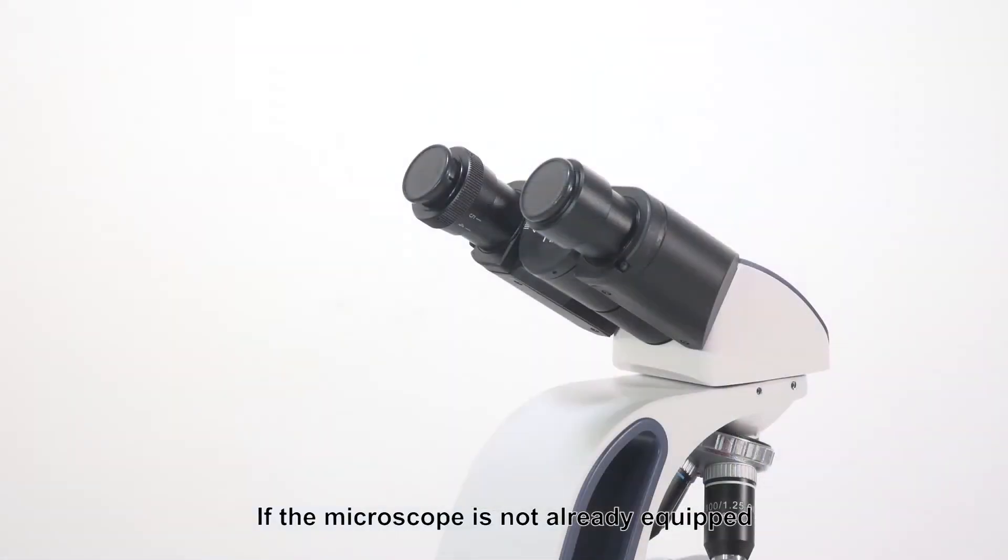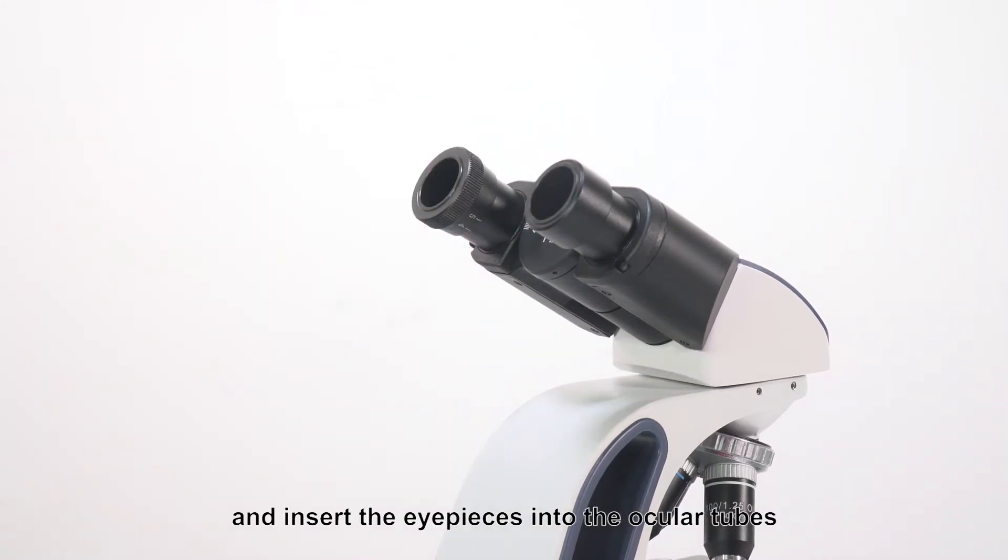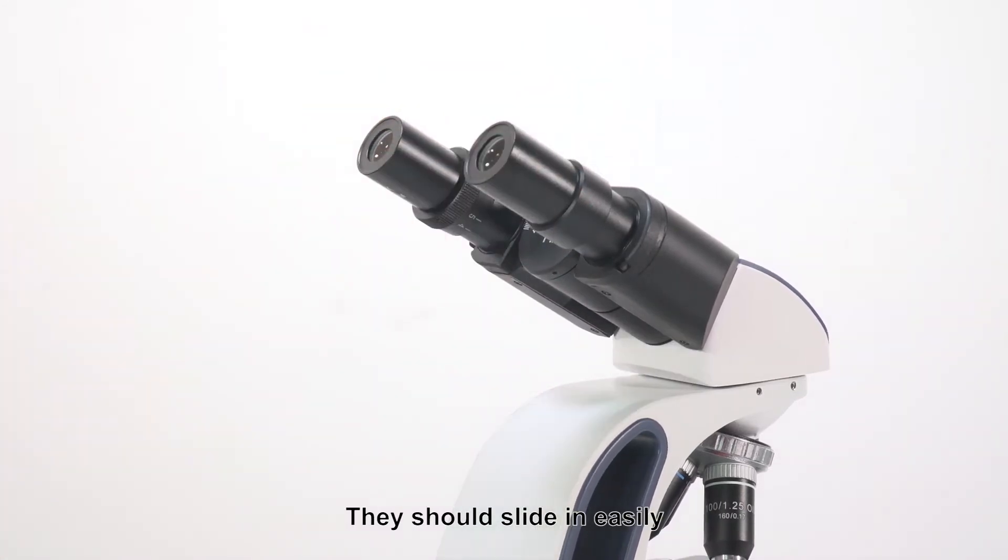If the microscope is not already equipped with eyepieces, locate the ones included in the box. Uncover the eyepiece holders on the head of the microscope and insert the eyepieces into the ocular tubes. They should slide in easily.